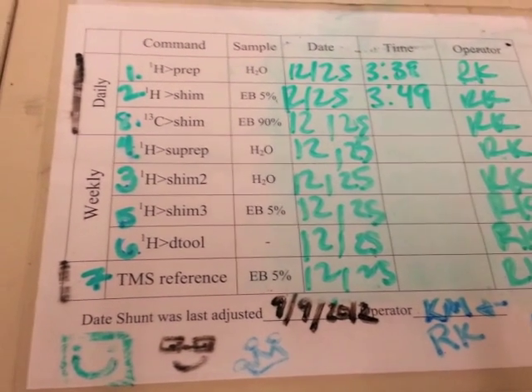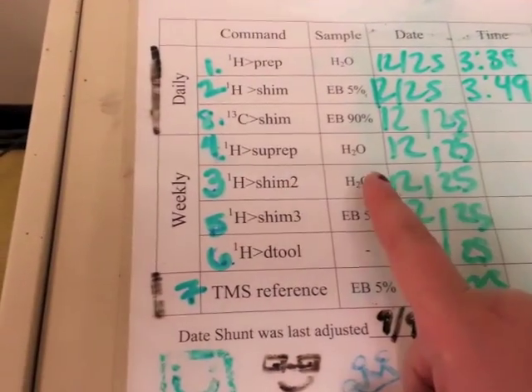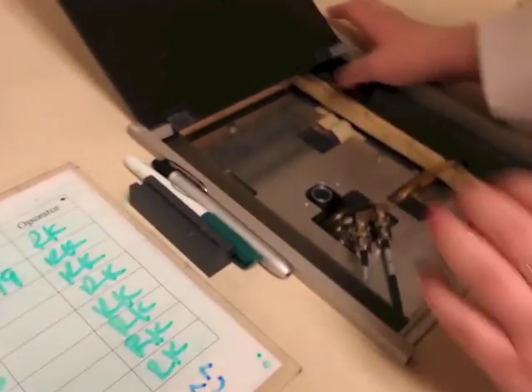After SHIM is done, the next step is SHIM2. For SHIM2, we need the water sample, so we're going to switch that out.